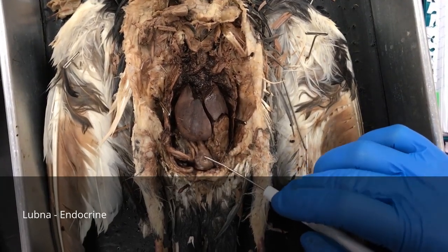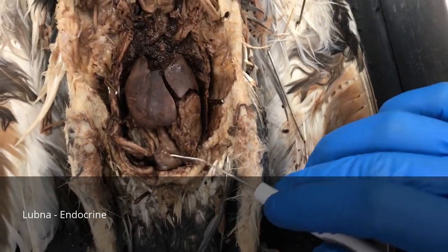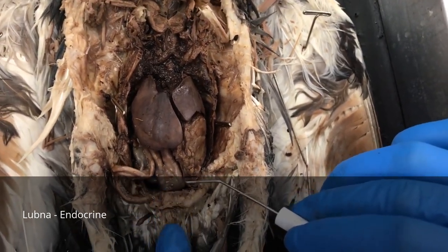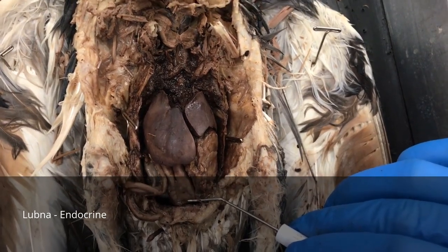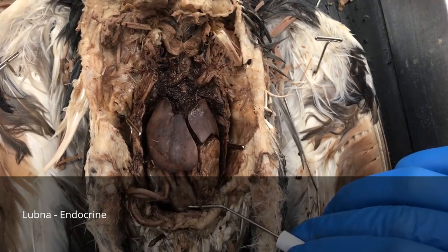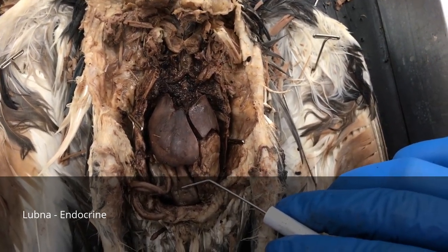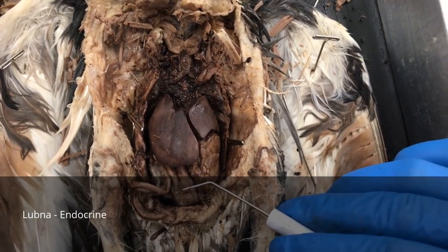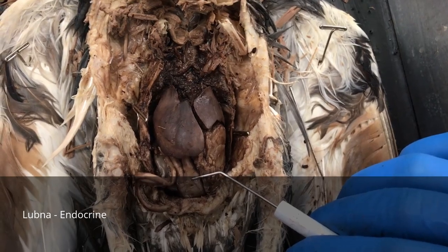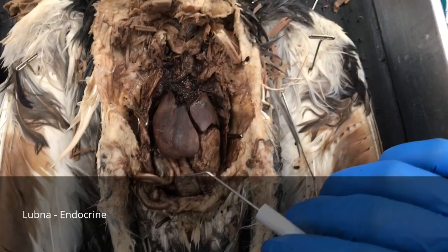Okay, so this is the pancreas, and it produces digestive enzymes that are secreted into the small intestine. And it digests also all the fats, and it plays a role in protein digestion. And it also neutralizes the acidic food mixture coming from the gizzard, so the digestive enzymes can work. And it also produces insulin that is important for blood regulation.